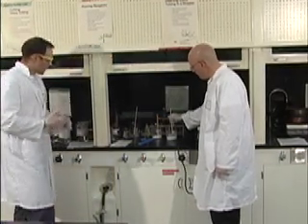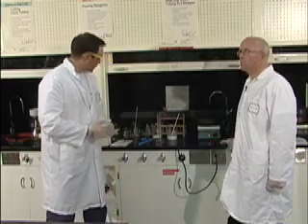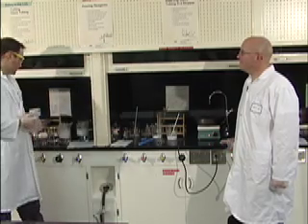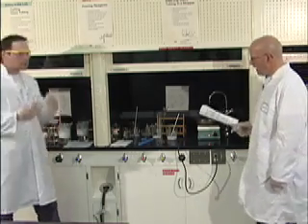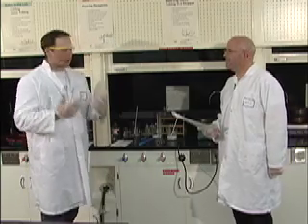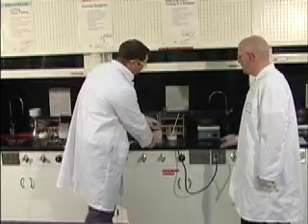Once you're done that, you're going to measure out in your 100 ml graduated cylinder exactly 70 mils. I believe it's 70 mils. 70 rings a bell to me. Oh, sorry, 80 mils. It says about 80 mils. We want to measure out exactly 80 mils, so we can change that in the lab manual. Exactly 80 mils of ethanol.